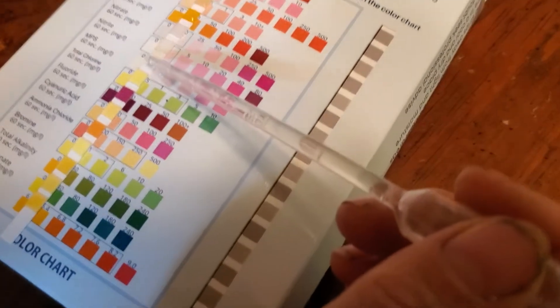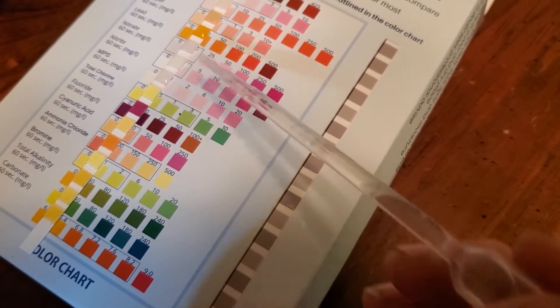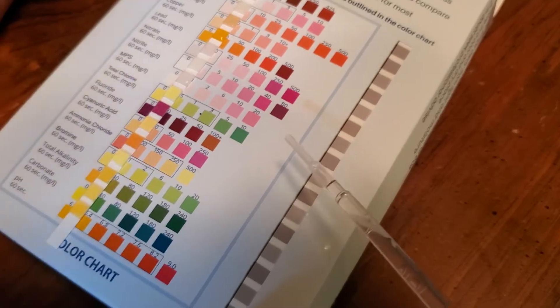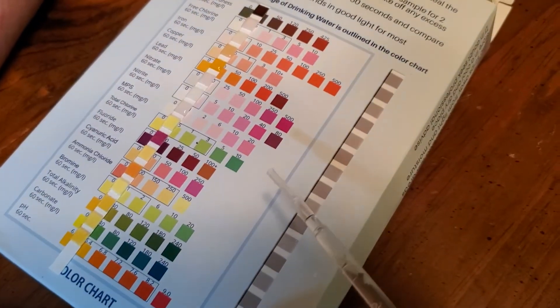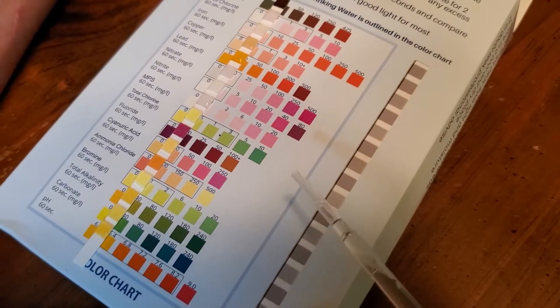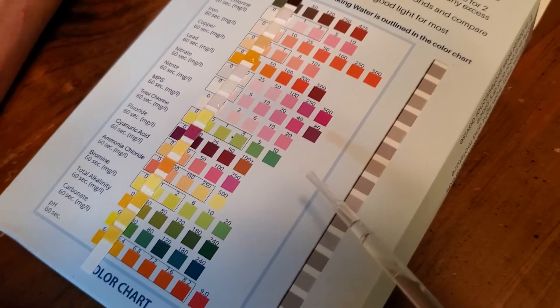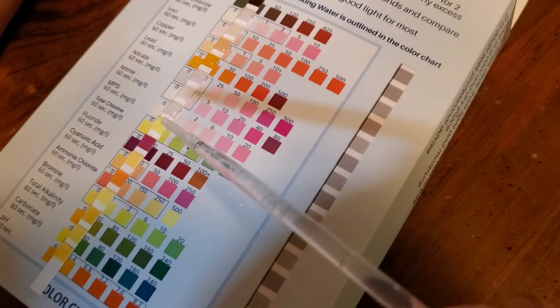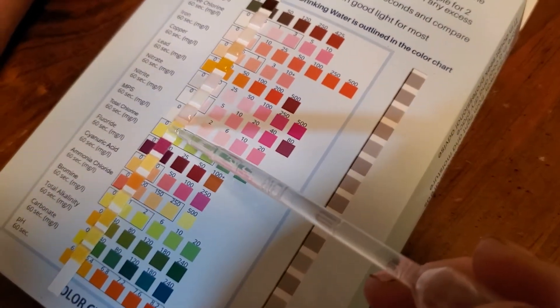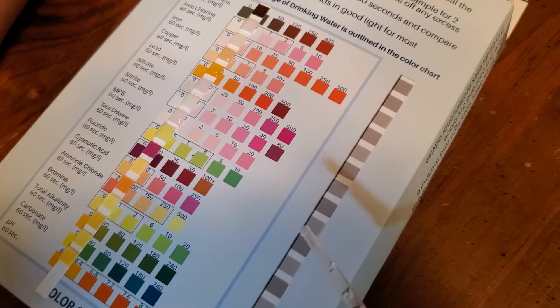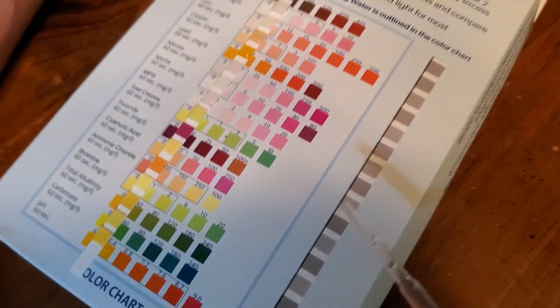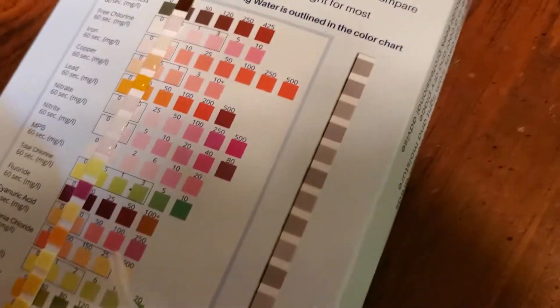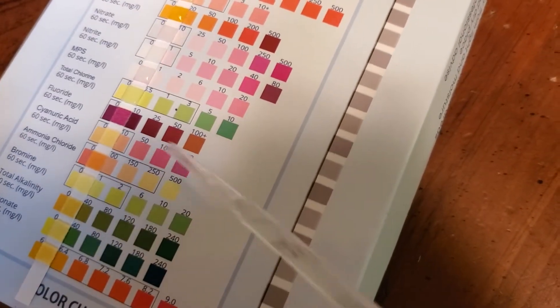Okay MPS, whatever the hell that one is. There's no safe range on it so I guess it's just some random number to know. That looks like we got a little bit of color there. Chlorine should be zero because we have well water, but it's definitely not zero. I'm more concerned about the lead thing still.